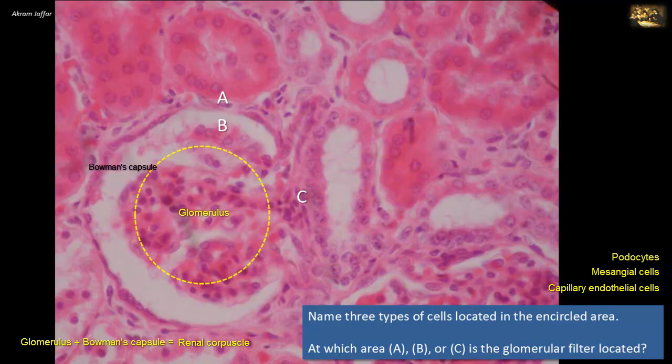The mesangium is a specialized connective tissue consisting of mesangial cells and mesangial substance, an extracellular substance that provides support for the capillary loops. The mesangial cells are large cells with phagocytic and contractile function. The podocytes invest the surface of the glomerular capillary loops exposed to the Bowman's space, so the glomerular filter is located at position B.